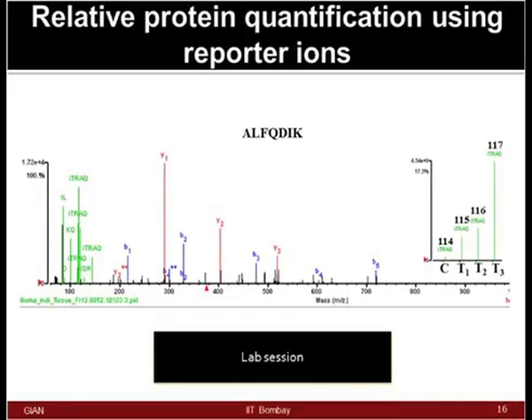And you will look at, for each one of these peptide sequences, what the reporter ions for MS/MS are, which will help you do the quantification. So, these are the ways of doing data presentation for this kind of iTRAQ workflow. Not every single piece of data can you show in your papers and reports, but at least certain peptides you need to show, so that your quantification looks accurate and your claims of up or down regulation actually make sense from various peptides.